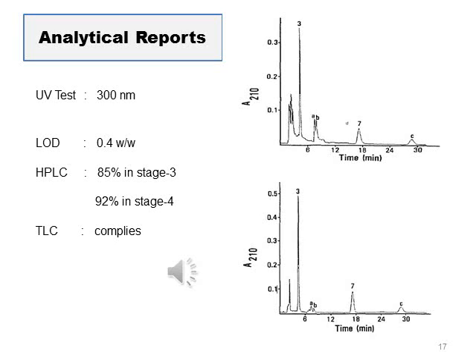The HPLC graph was shown here. Top is 85% of the stage 3 we shown, 92% of stage 4 is down. The major peak is vindoline, that and the other is a known impurity. Before the major peak, it's an unknown impurity we removed in this recrystallization section.